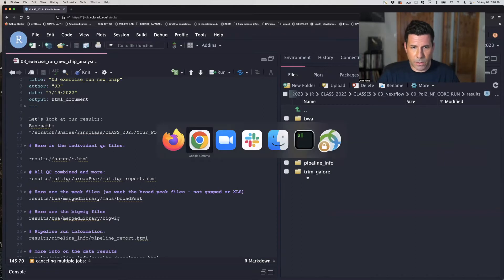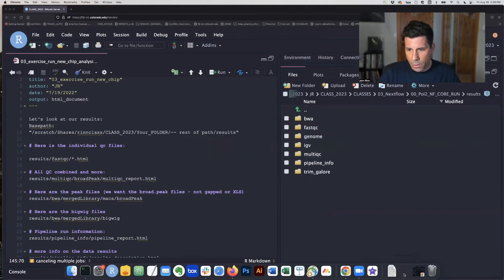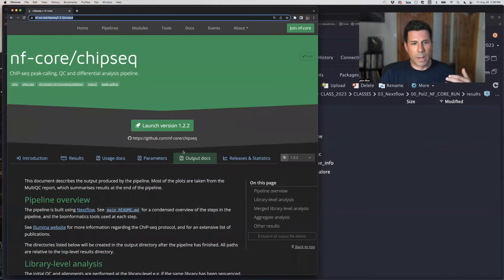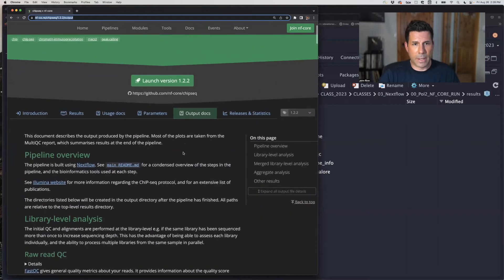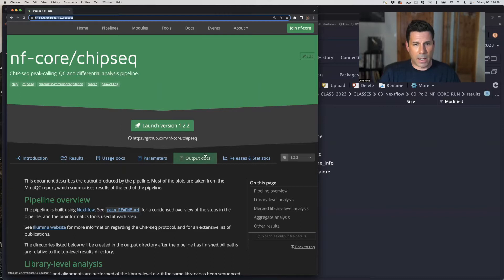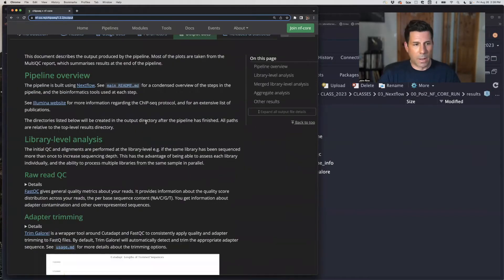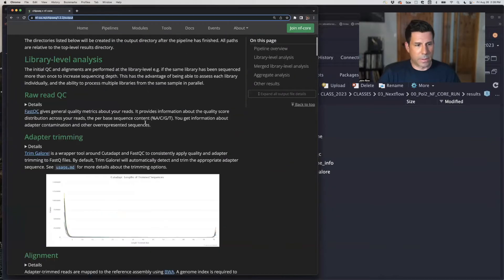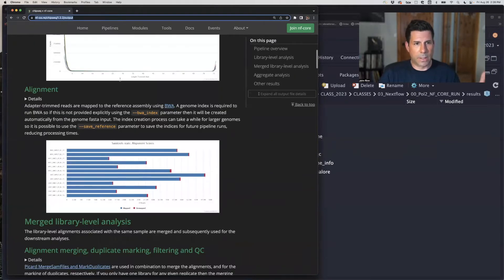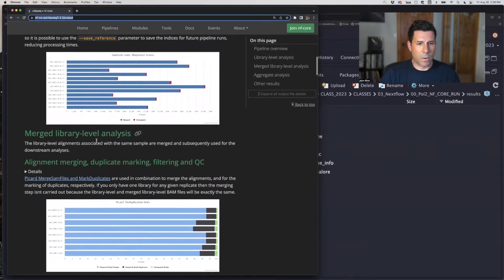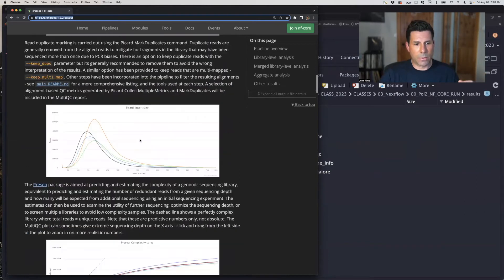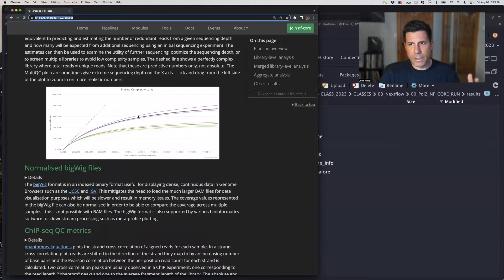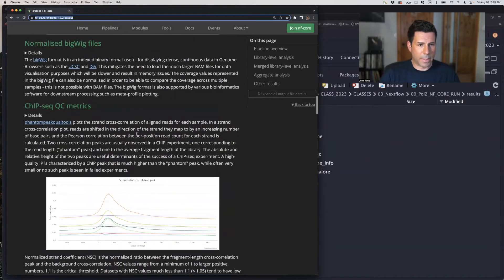So first, let's go to the NFCore pipeline. As I mentioned, I'll say it over and over again, but documentation is your friend. Go read it. Figure out what's happening. And here I am on the NFCore ChipSeq pipeline that we just ran. And I clicked on output documents, which gives a little overview of everything that was run. The first thing you have to do is read, take the sequence reads from your ChipSeq and align them to the genome.